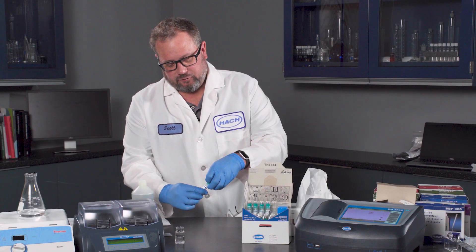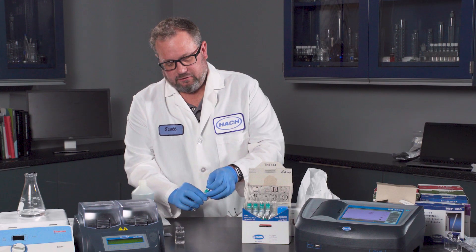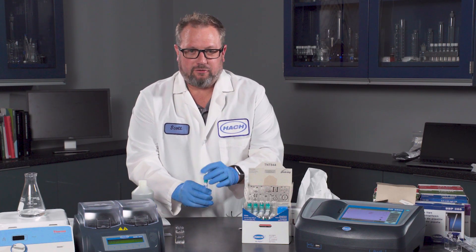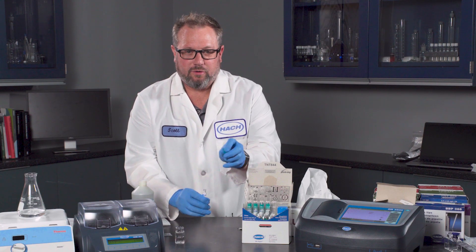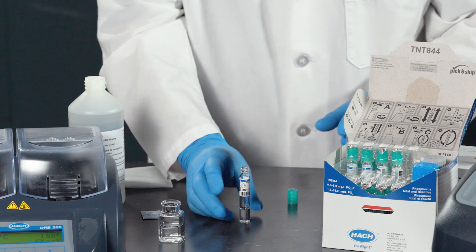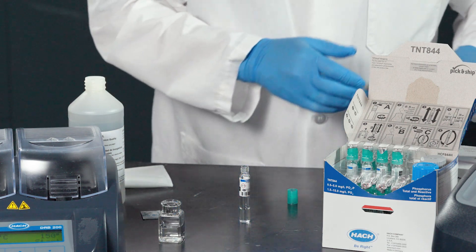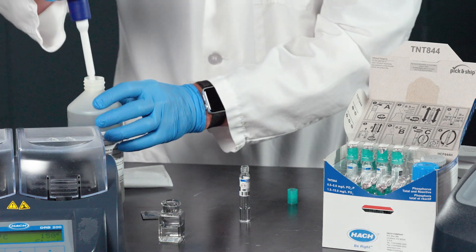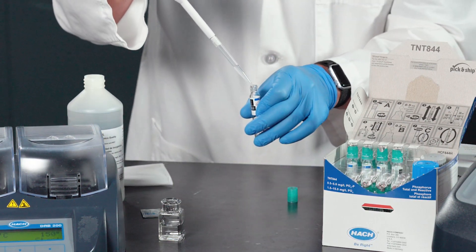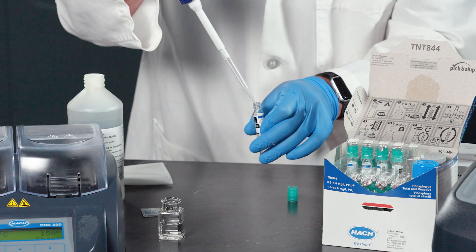Within this little dosycap that comes with the kit, the persulfate is already included. All you have to do — in this case it's 0.5 mL — is add 0.5 mL of your sample. Here we're going to add a standard, 0.5 mL into the vial.